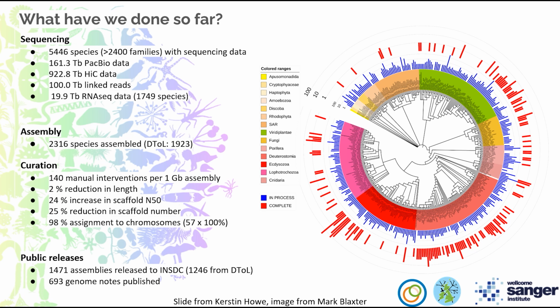So these are species that might have some PacBio data, but we need to do more sequencing to reach coverage, or perhaps we are waiting for the Hi-C library to come through. But they've started their journey. They're in-house. They are being worked on.